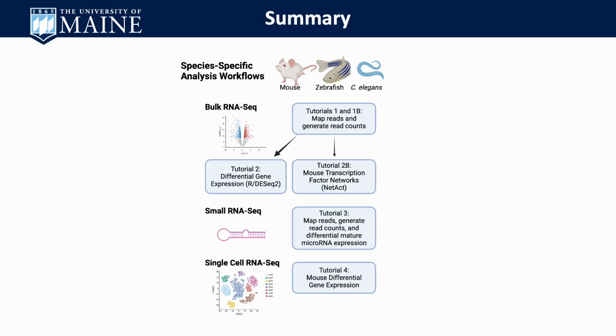So in summary, we have these sets of tutorials that cover how to analyze RNA sequencing data that's either generated with bulk RNA sequencing, small RNA sequencing, or single-cell RNA sequencing. So we hope you find these useful, and if you have comments or suggestions, please reach out to us.